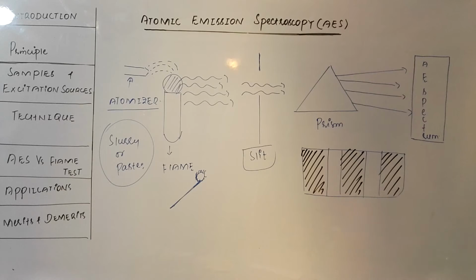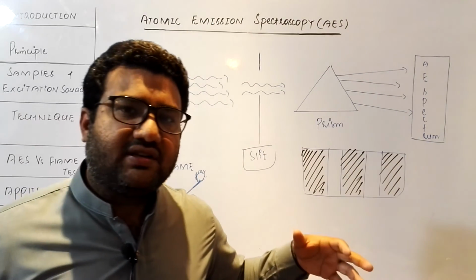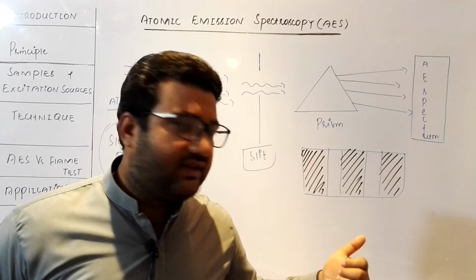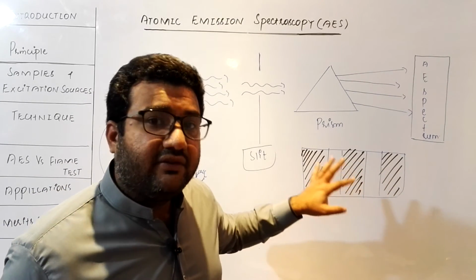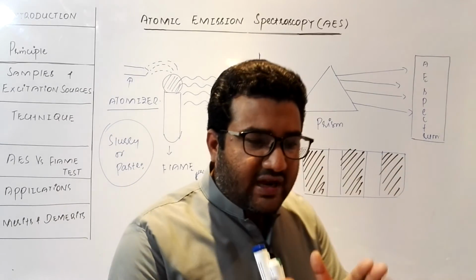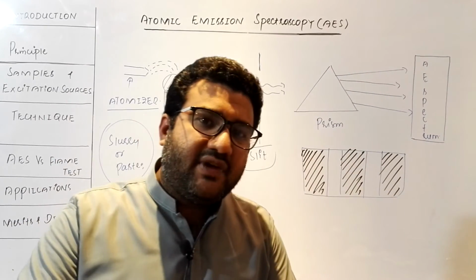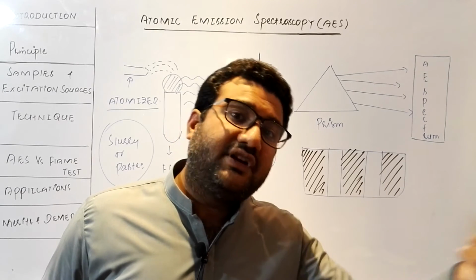But keep in mind one thing I have already told you, that during de-excitation, every atom of the different element emits different photons having different energy frequency. So the position of the spectral lines will also be different in case of atoms of the different elements. So atomic emission spectrum of an element is its characteristic feature, and the atomic emission spectrum of one element is very different from the atomic emission spectrum of atoms of other elements.